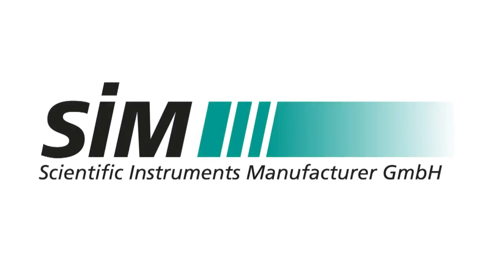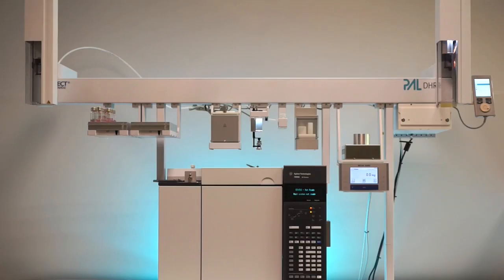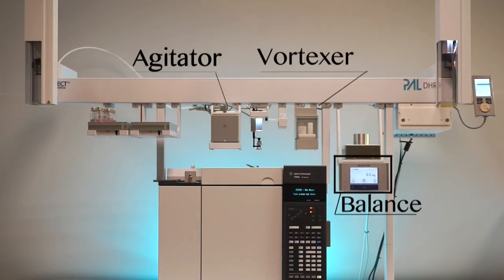We'd like to present you a fully automatic sample preparation for Headspace GC analysis. A PAL3 Connect has been equipped with a vortexer, an agitator, an integrated analytical balance, and a cooled rack for storing the internal standard.